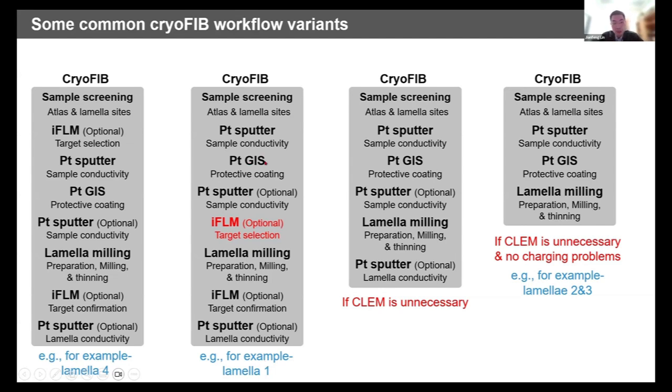And for some systems, if you don't have an integrated fluorescence microscope in your system, or if your sample does not have fluorescence signals, in this case you can skip this step, which will speed up your milling, and then throughput will significantly increase. So this is this method.